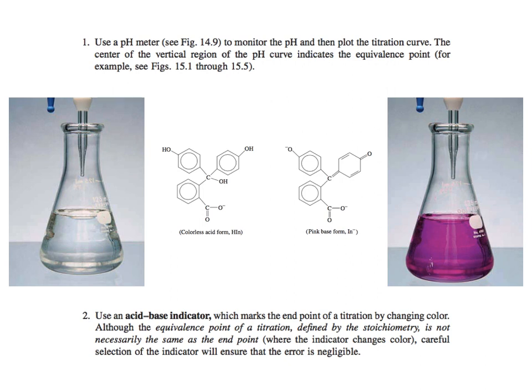Finally, for titrations that are performed routinely, we may use a pH indicator, which can indicate the equivalence point of the titration by changing color. Since the equivalence point is technically different from the point at which the indicator changes color, we give the point at which the indicator changes color another name. That is, the end point of our titration.